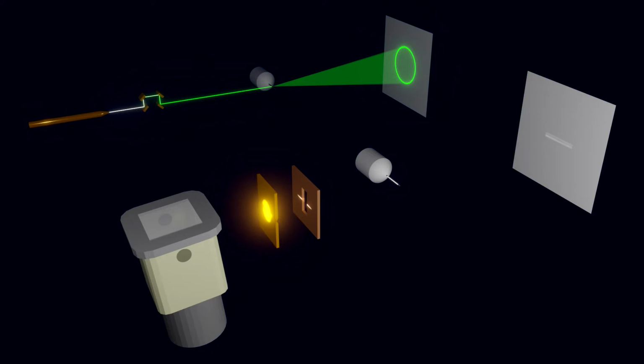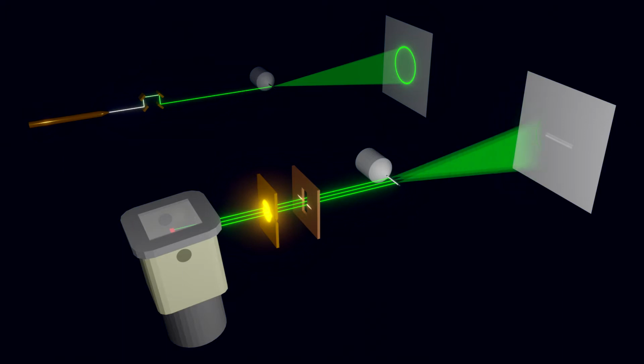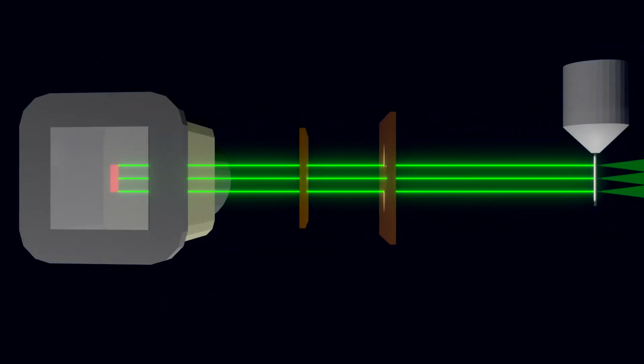The primary beam has the shape of a parallel ribbon and it illuminates the capillary over a length of several millimeters. We get a diffraction signal from the entire illuminated length, which means that the diffraction rings on the detector plate are smeared horizontally. Furthermore, even though the outer shape of the ribbon-like beam is parallel, we can still have divergent rays in the beam due to the finite width of the target.